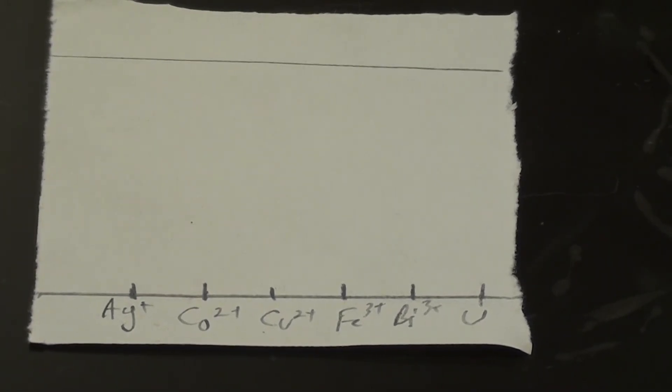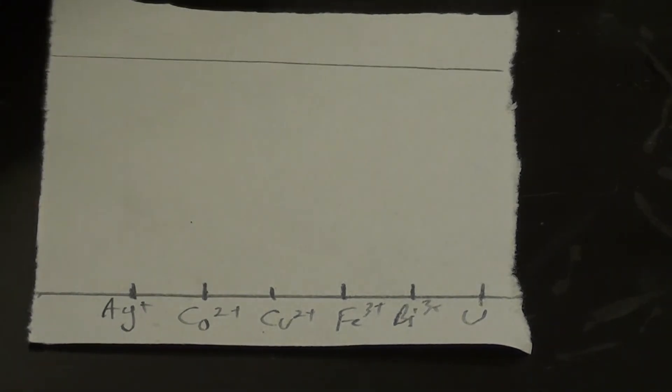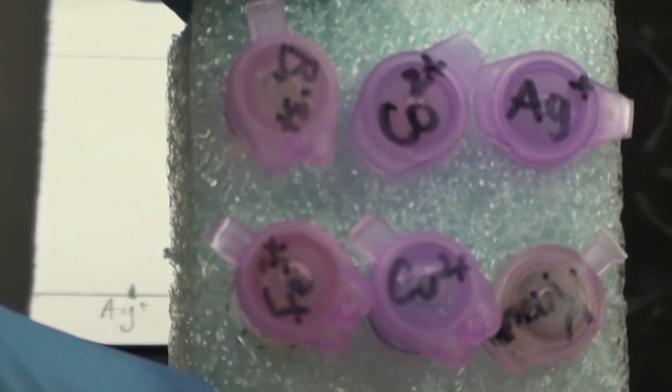So what I'm going to show you now is how to spot a TLC plate or TLC chromatography paper. Now what I've got here are samples, and these samples are in these micro test tubes here.